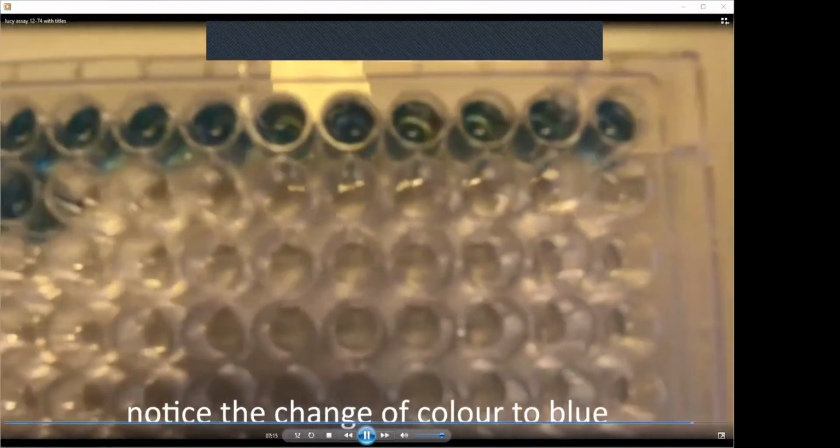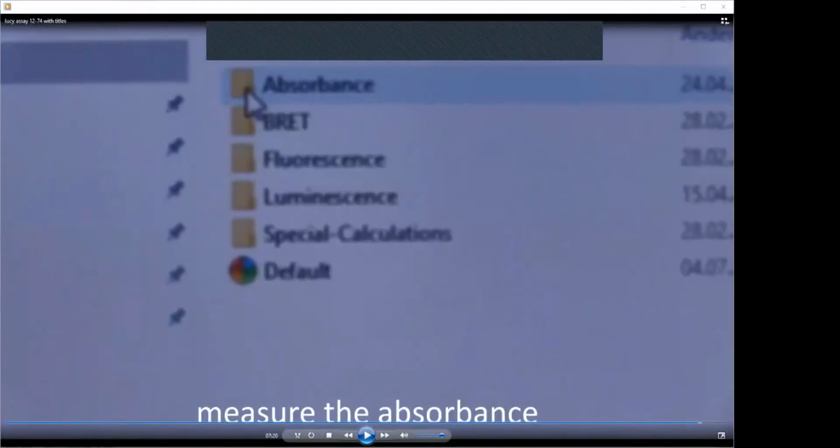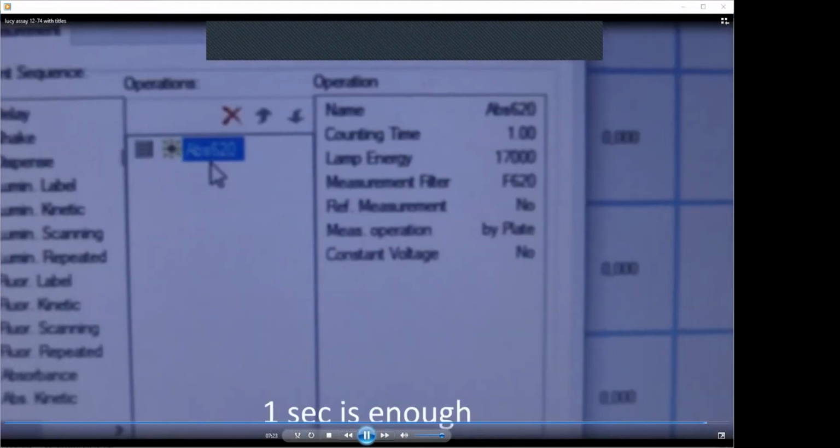And then it is used for the measurement of the absorbance using the same instrument, but in this case, the algorithm is for absorbance, and it is at 620 nanometers. Optimally, it should be 595, but the problem is that this particular instrument has only a few filters, and the closest filter to this wavelength was 620. So that's the reason why we decided to use this filter.